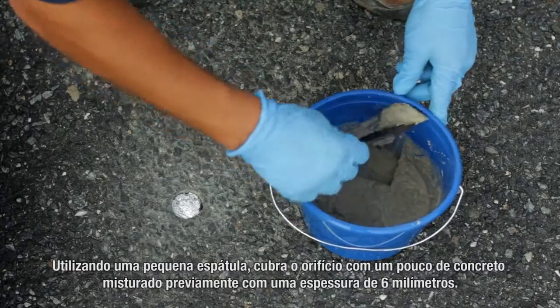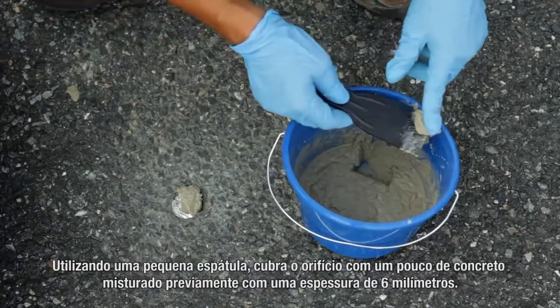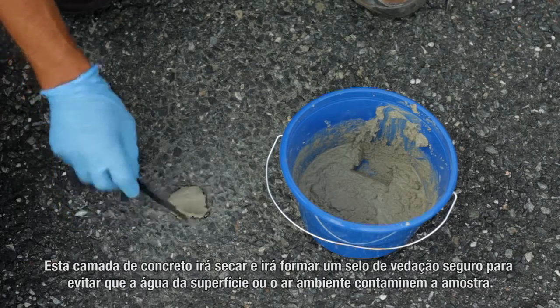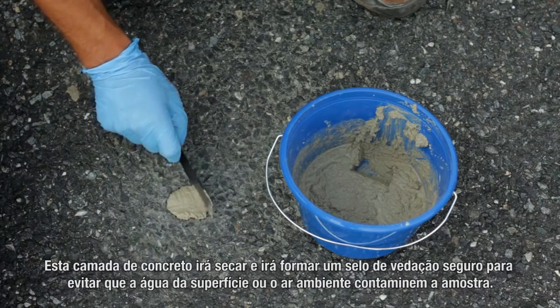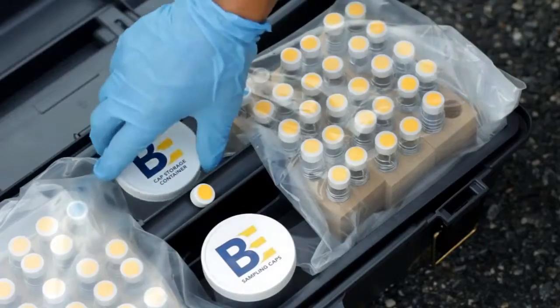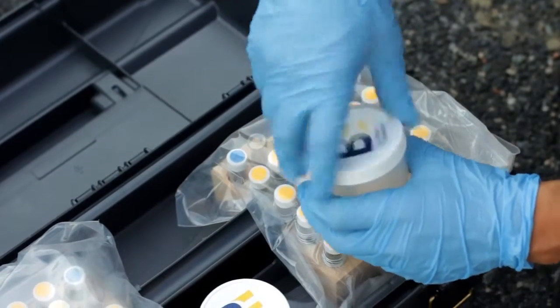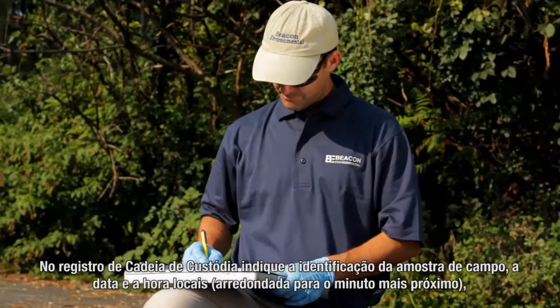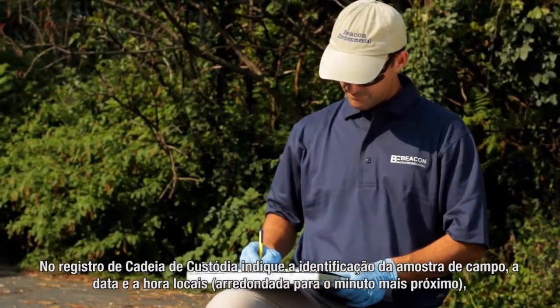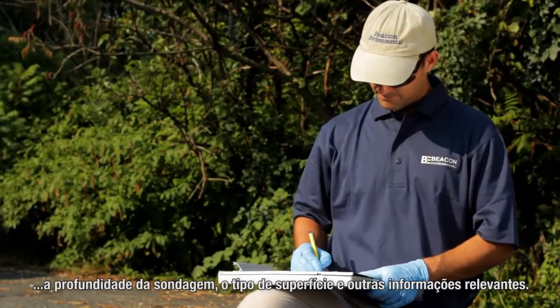Using a small putty knife, cover the hole to grade with a one quarter inch thick concrete patch that was mixed ahead of time. This patch will dry and form a secure seal to prevent surface water or ambient air from biasing the sample. Place the solid cap in the cap storage container and close the field kit. On the provided chain of custody, record the field sample ID, the date and time of emplacement to the nearest minute, the sampling hole depth, the type of surfacing, and other relevant information.